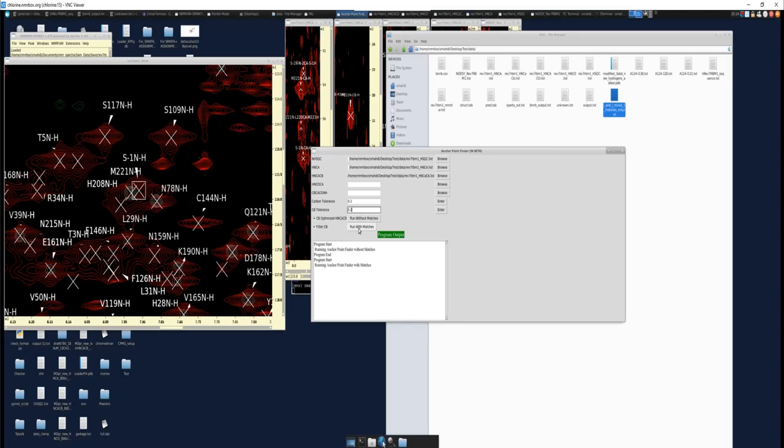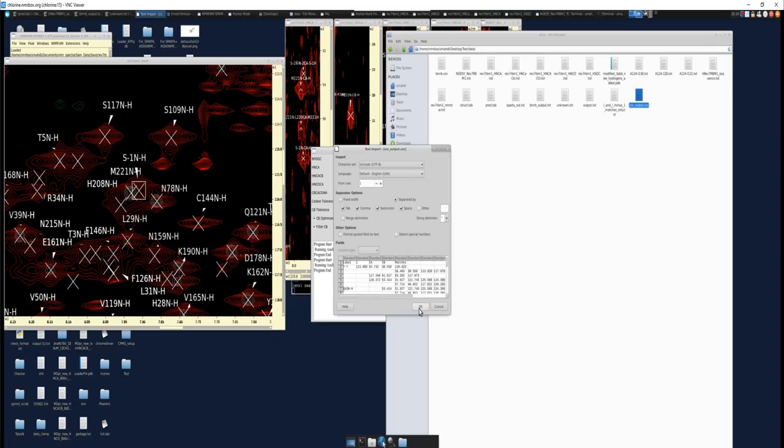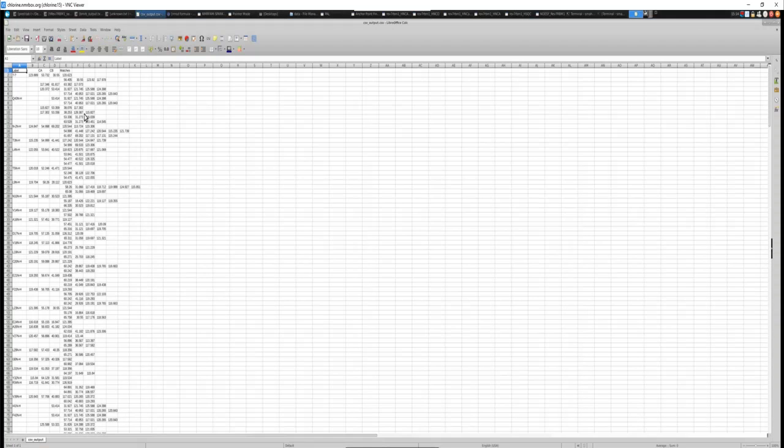So you'll notice this will take a couple seconds longer because it has to run that strip plot. It'll give you this CSV output file, right? And this is not a text file anymore, it's a CSV file. And so you'll have your label as before, and you'll have the nitrogen peak, so that's the peak you're looking at. Now in this case, this program that's using a strip plot does not differentiate which is the I and which is the I minus 1.